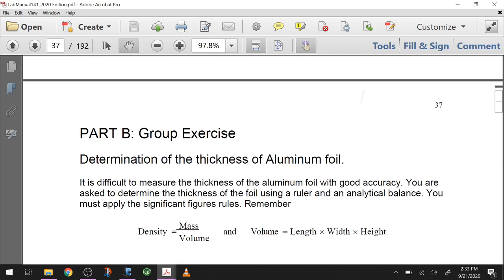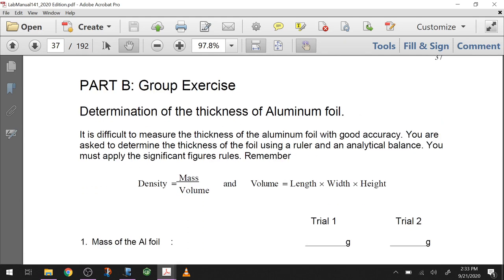Part B: aluminum foil thickness. Here we're using an actual rectangular sample of aluminum foil with the idea that two of the dimensions are easy to measure. If I take a simple sample of aluminum foil, I can use a ruler on the length and the width. I can't use a ruler on the thickness—it's too thin. So the only way I can get the thickness out of this is to actually do a calculation using the existing density. Mass for a sample like that is easy—we just fold it up so it fits on the balance and weigh it. Volume here we're going to do by calculation using the rectangular solid: volume is length times width times height. We're going to use a ruler to give us two of those, and we're going to have a density given from the table and a mass we could easily measure. So we can put those numbers together and solve for the missing dimension.